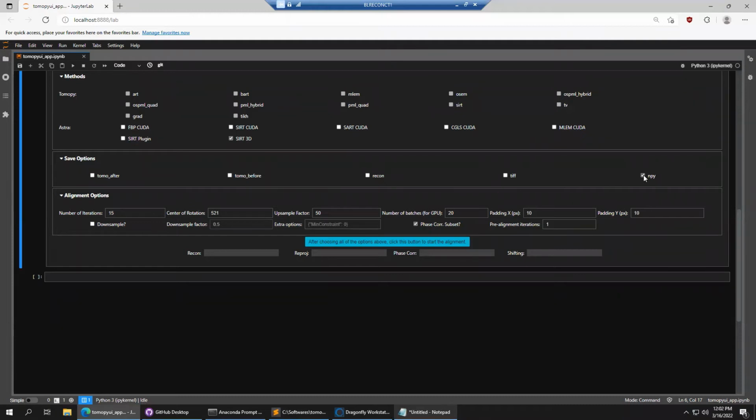And then again, this option is good if you just want to. But all of this is fine. You can save all of this information if you wanted to, but I'll show you why you don't really have to necessarily, coming up in a couple of slides.